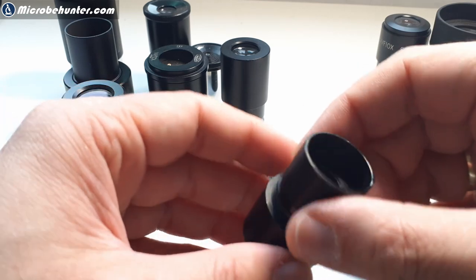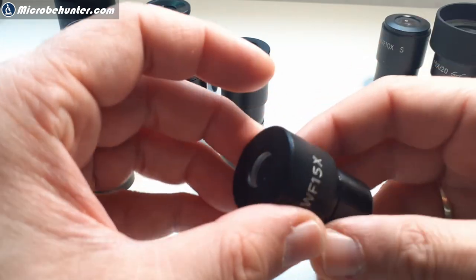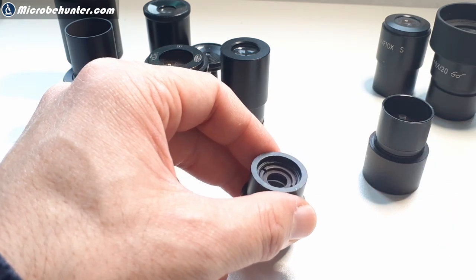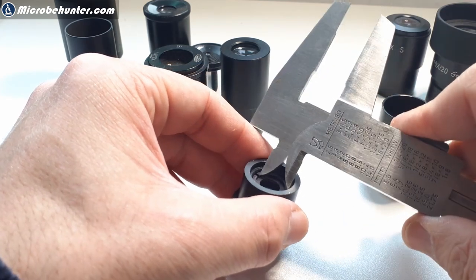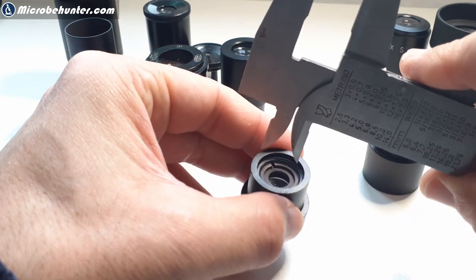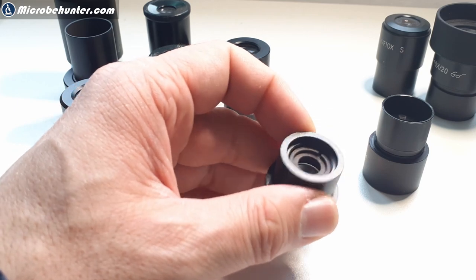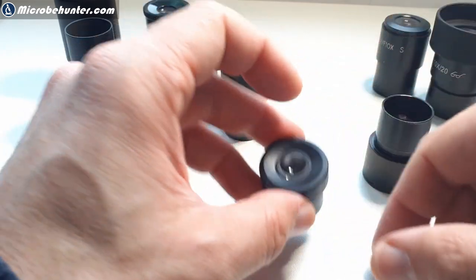To remove the individual lenses you need a special tool. I'm going to illustrate this using a caliper - you insert it right on the side into those little notches and then rotate to open it up. I won't actually do this because I don't want to damage or scratch the eyepieces, and there shouldn't really be a reason to open it anyway because in most cases there should be no dirt inside - this one is closed completely.